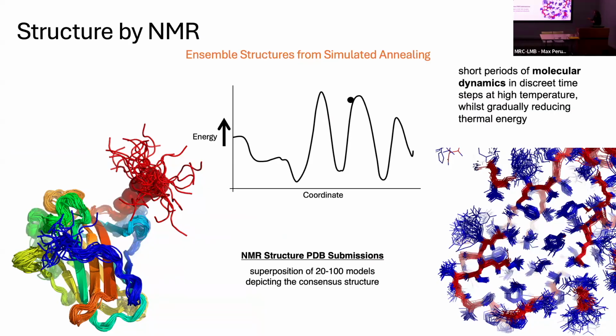The protein folds up, and then what you want to do is end up in a global conformational minima, but obviously there is more than one minima in that system. So how do you know you're in the right minima? You do this hundreds of times, and then you should have an agreement that you're always going into the same minima. Then you have confidence that your fold is the right global minima.